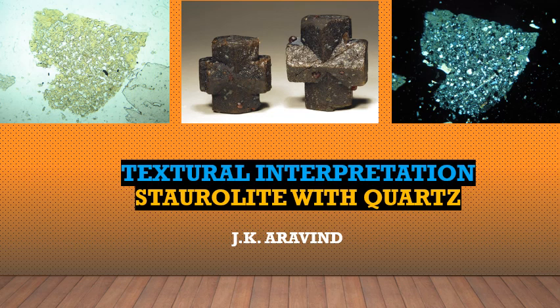Hi, hello, good morning. Today we will discuss the significance of texture with an example, staurolite with quartz. That is nothing but a textural interpretation. How will we do this? We will see this one.